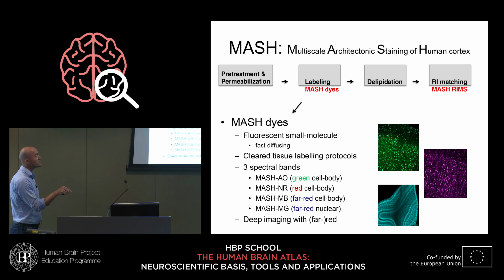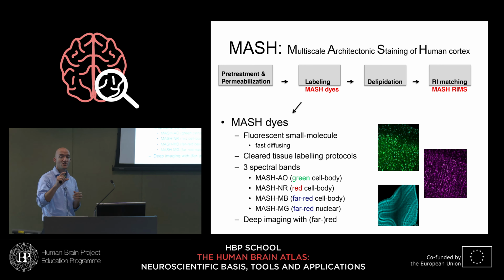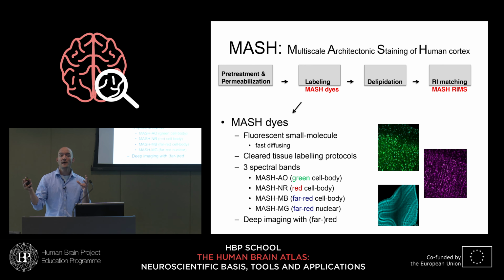And also going into the red, into the far red, allows you to image really deep, because of course all the signal loss in thick tissue, even when it's cleared, is due to scattering, and longer wavelengths, more red and far red, scatter less.